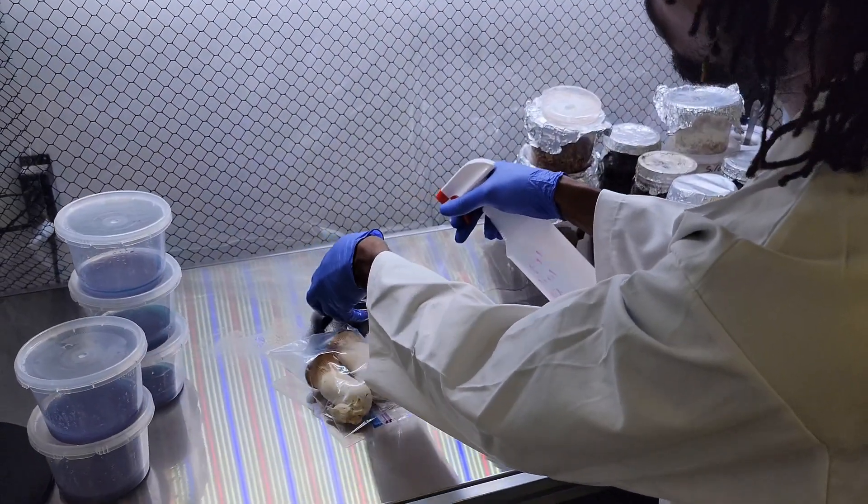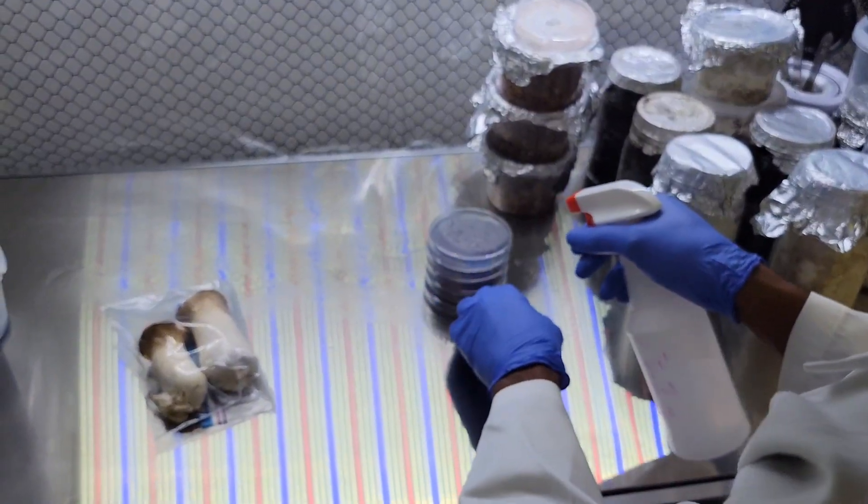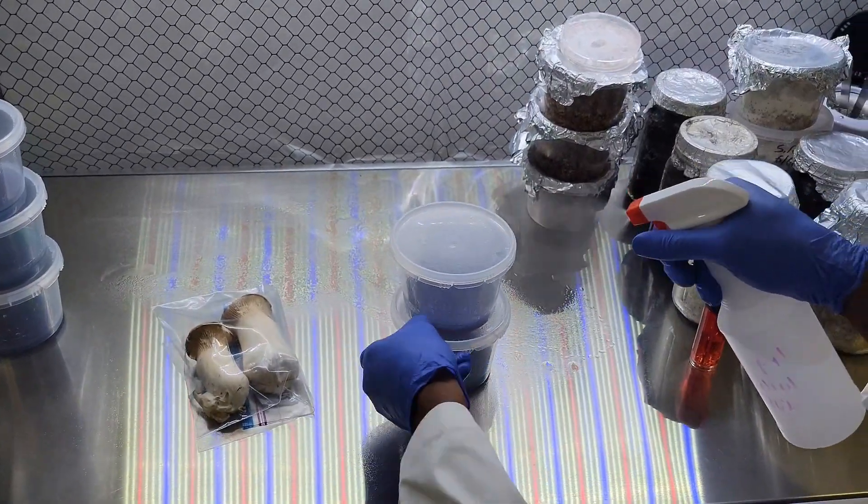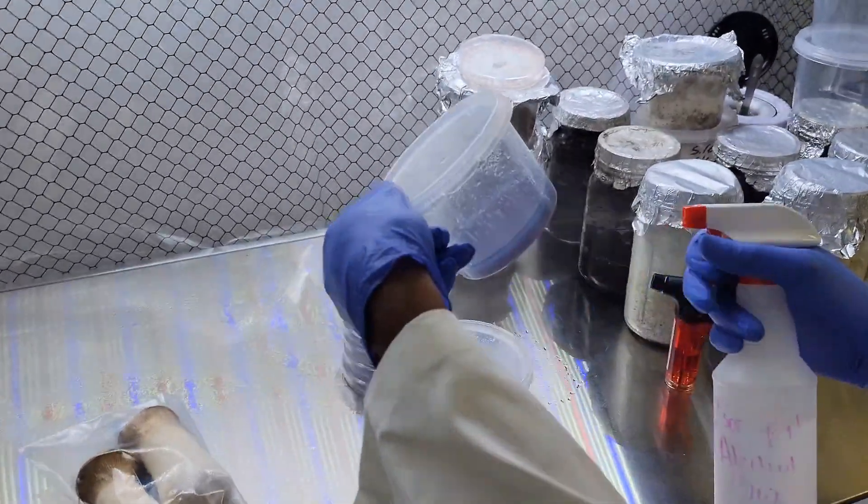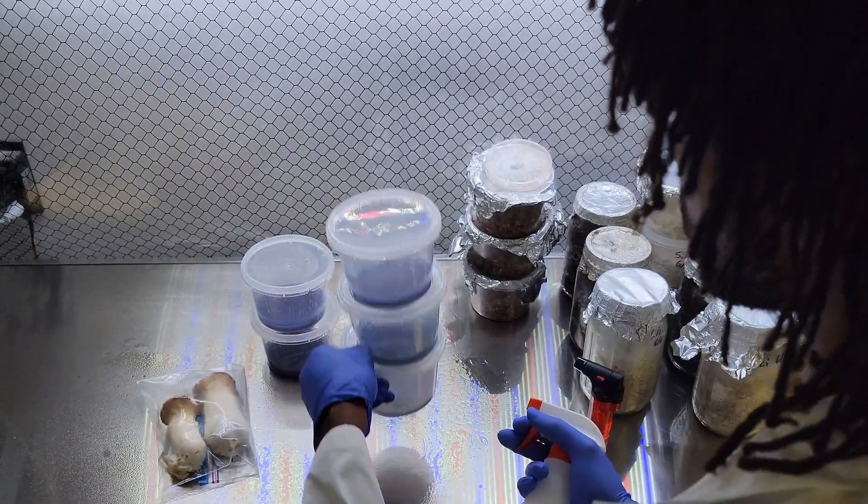Back in the lab again. You guys know the deal, we're making sure everything is sterile before we get started, spraying our petri dishes. Today we're working on king oysters, also known as Pleurotus eryngii. We're going to be inoculating plates and cups that have the same media.